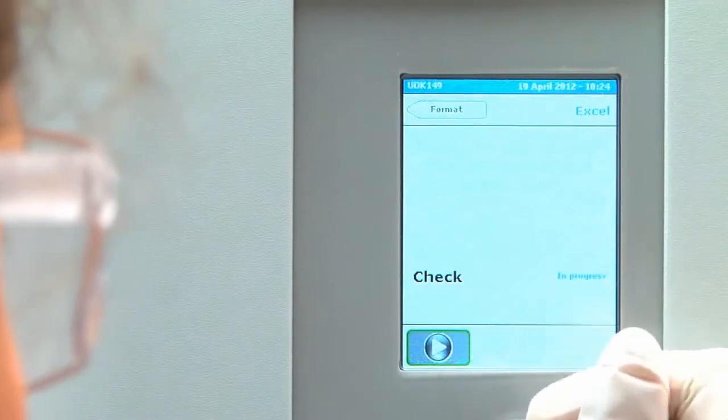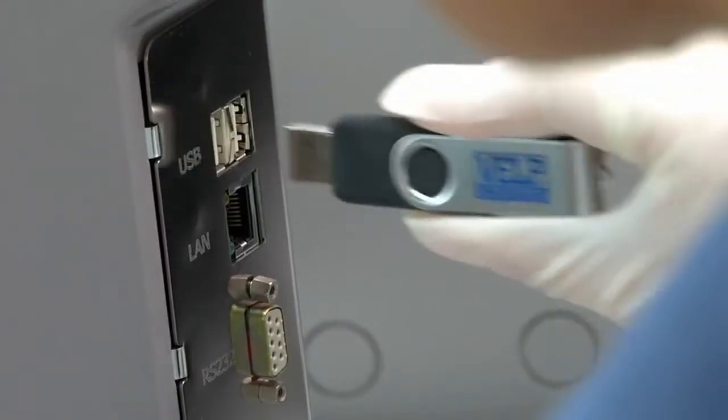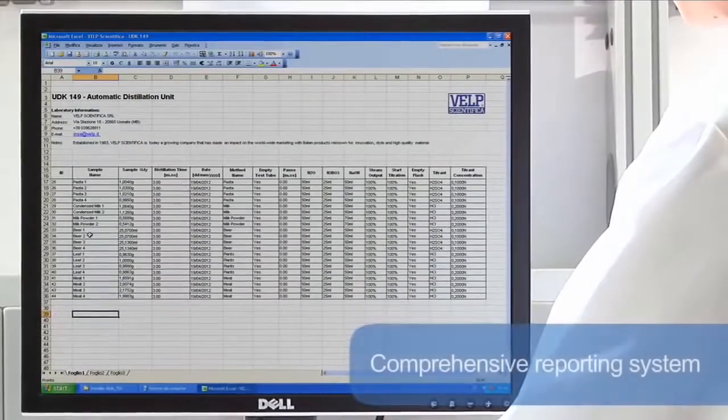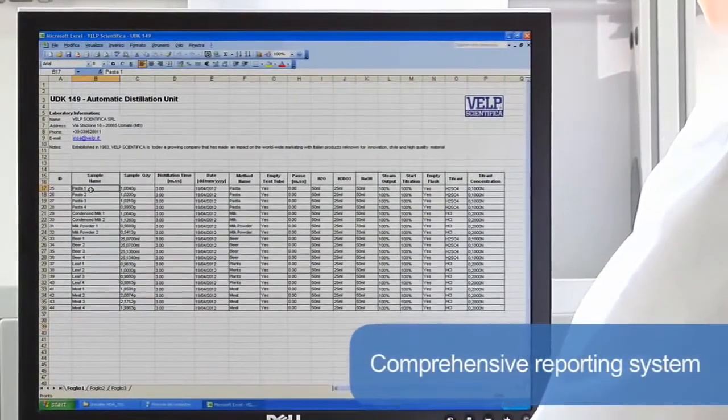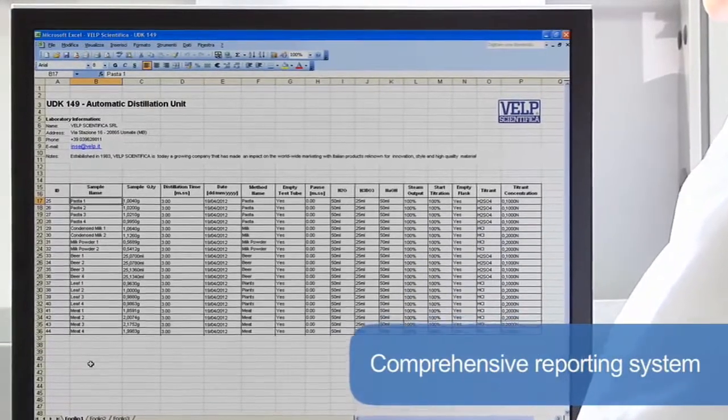Results can also be exported with a USB pen drive or managed with remote control via Ethernet. The comprehensive reporting system offers downloading to PC and transferring to LIMS for maximum flexibility of data management.